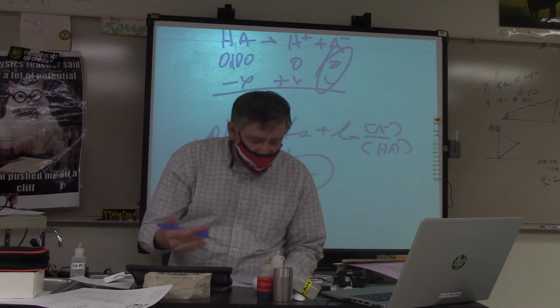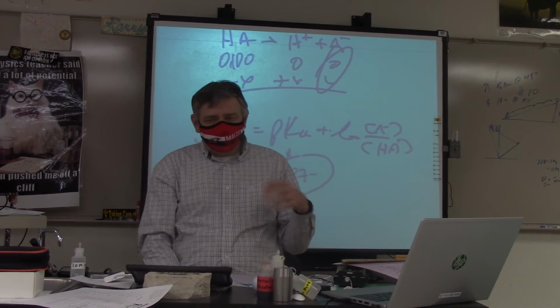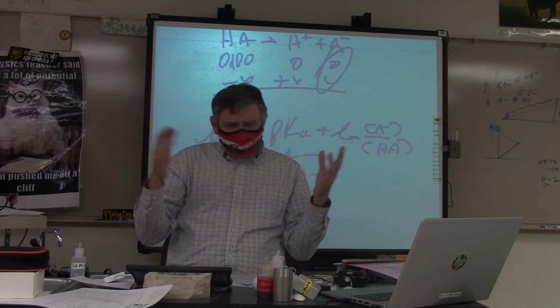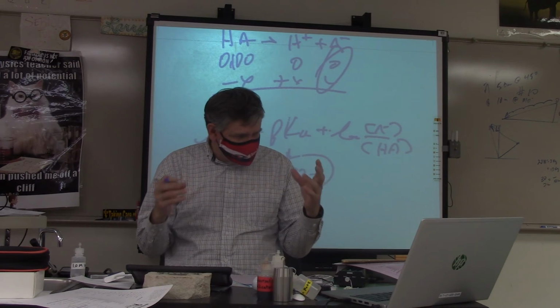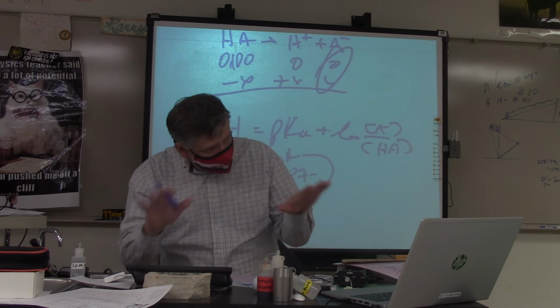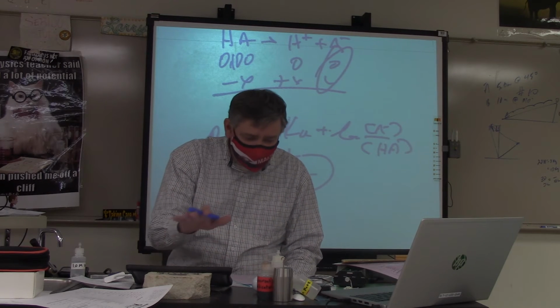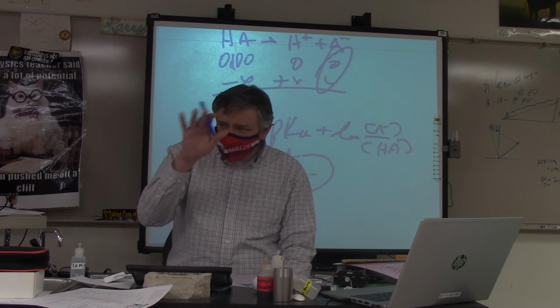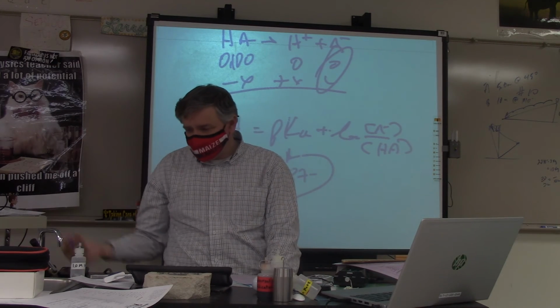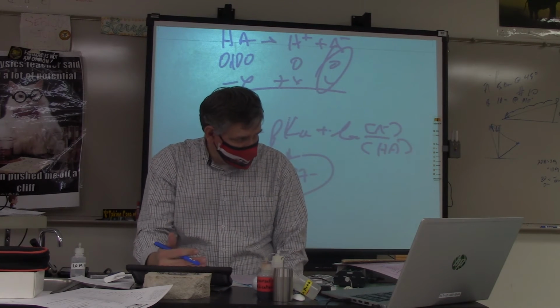Now, when you get over to questions 11 and 12, I'm not necessarily looking for the actual pH values, because this water is notoriously a little bit acidic from the get-go, so you don't get the true results that you would get theoretically. But here's what I want you to see: on number 11, you should see a shift in the pH, and on number 12, you should see a change in your pH. It's not going to be a dramatic change, but you should see a change in that pH, okay?